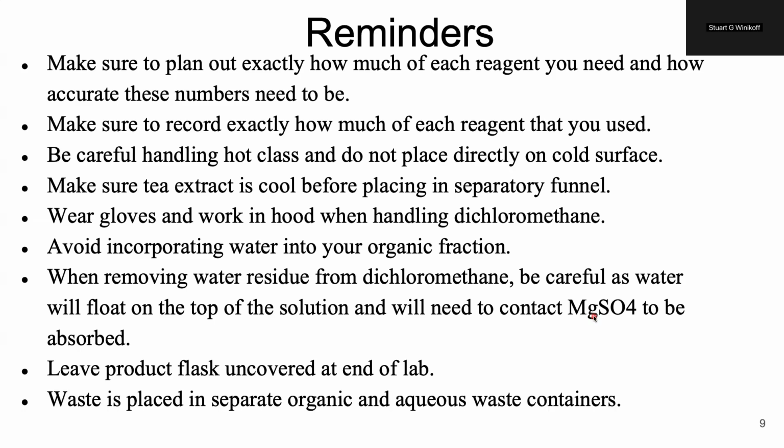Now, the last final thing to keep in mind is that we have a separate waste container for our organic waste and our aqueous waste. Whenever you're working with something, pay very close attention. Am I using my dichloromethane, or is this mostly aqueous?